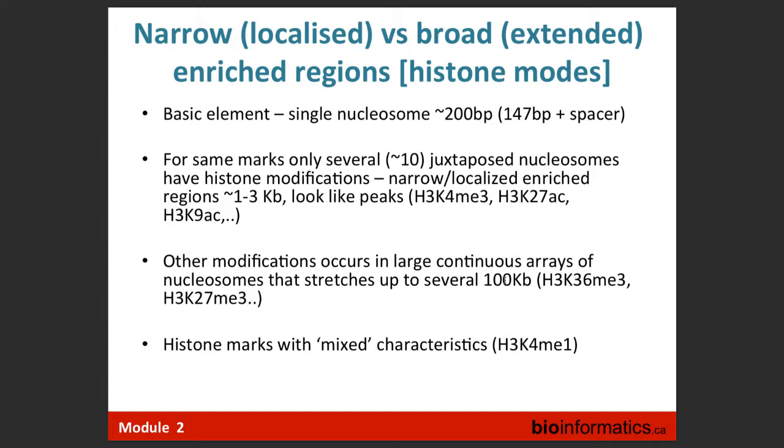Yeah, I always see that those tools are developed, and I just can't. And on top of this, of course, we're all a little bit subjective when we look. Second, the UCSC browser makes us subjective because there is pixelation, right? When we look at the picture and, whoa, that's a perfect peak, and then I zoom in, and I see a kind of jagged structure there, because it's pixel resolution, right? So it's a tricky thing. Now about biases, I want to throw in one more bias because we talk about biases.